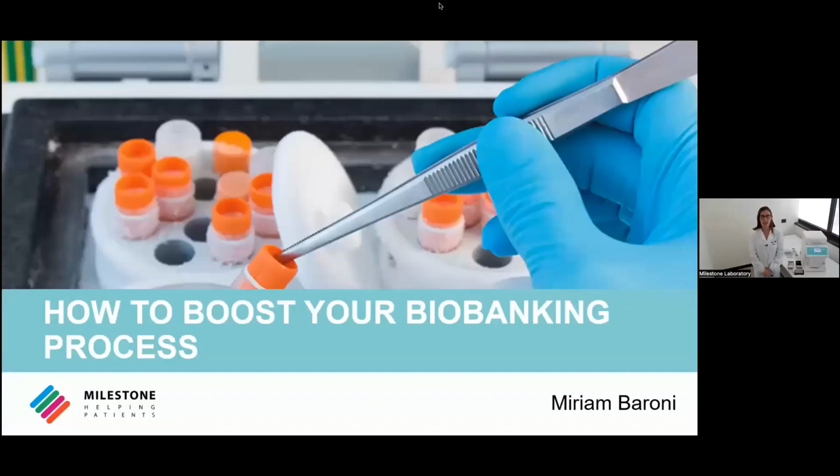Thank you, Michela, and good day, everyone. I'm Miriam, and I'm part of the Milestone application team. Today, I would like to speak about biobanks, especially for those biobanks in which it's really important to preserve the viability of cells.